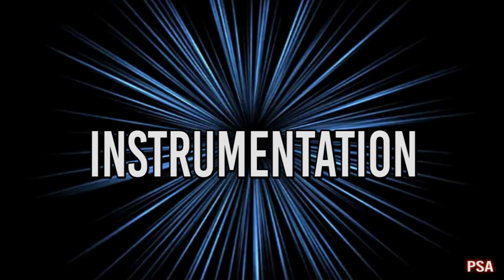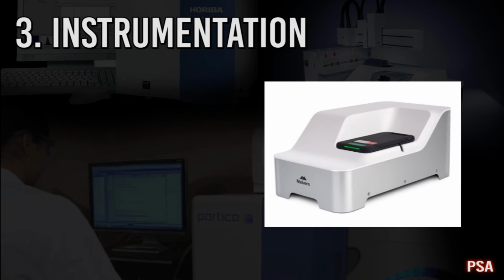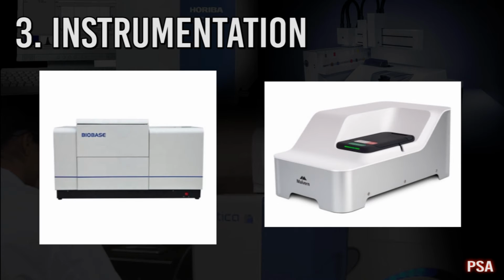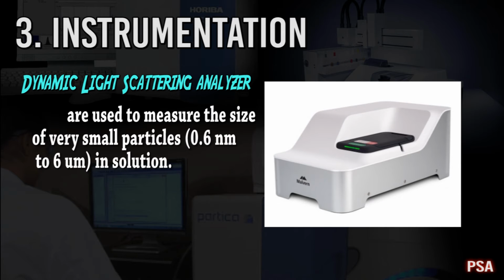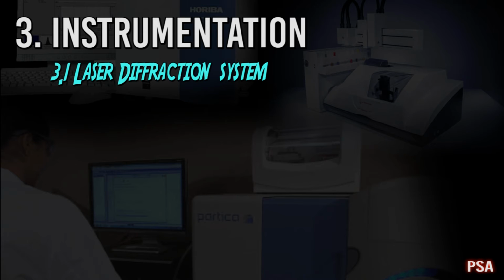Instrumentation. Two of the main types of particle size analyzers are dynamic light scattering and laser diffraction analyzers. Dynamic light scattering analyzers measure particles in solutions in the 0.6 nanometer to 6 micrometer range. Laser diffraction analyzers are used for particles in a material within the range of 10 nanometers to 3 millimeters, but we're going to focus on the laser diffraction system.